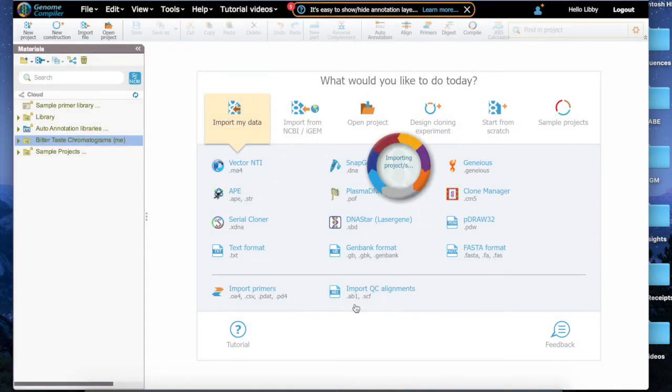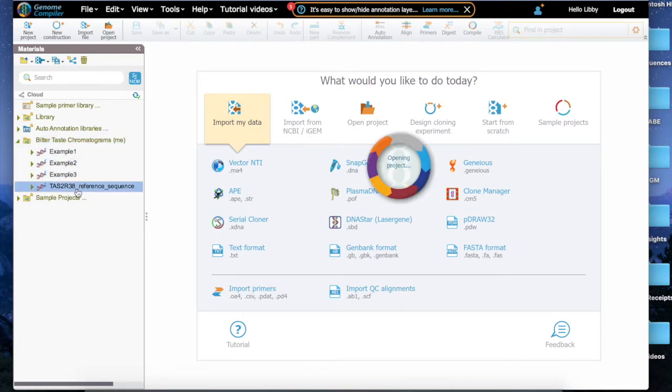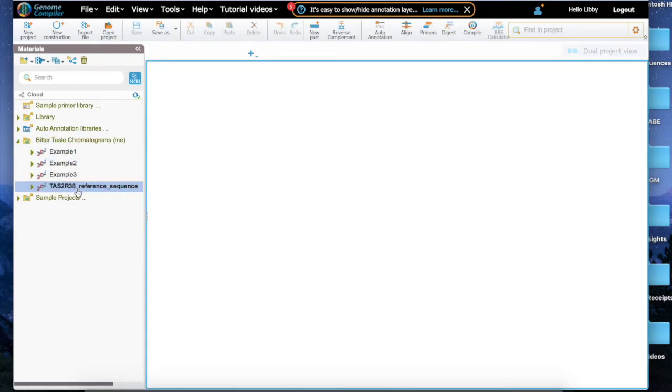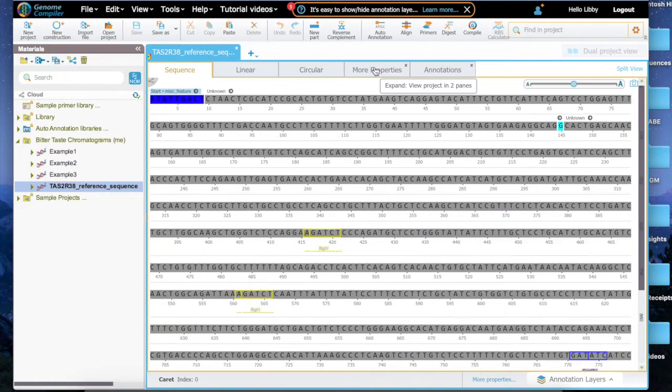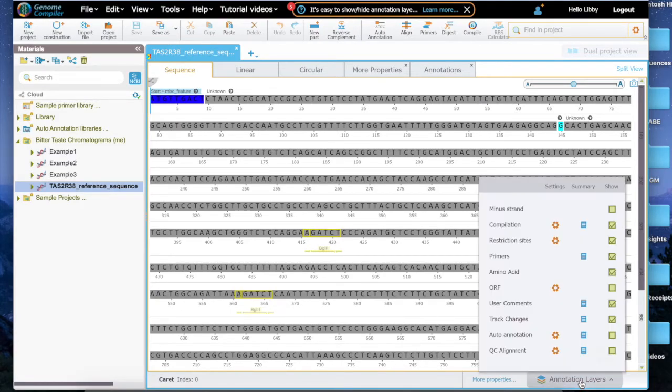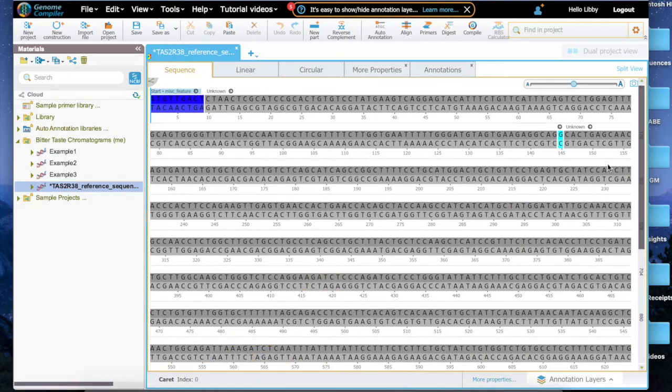Begin by opening the tas2r38 reference sequence. We're going to compare our other sequences to this one, so it's important to open it first. Double-click it to open the file in the Genome Compiler viewer. Click the Annotation Layers button in the bottom right of your screen and make sure the minus strand box is checked. You can now see the 3 to 5' strand from the tas2r38 reference sequence.